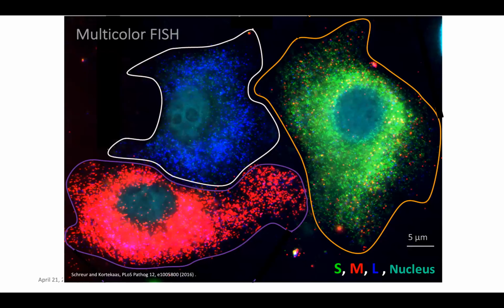We know that in biology, not a single species can work on its own. For most cases, individual genes need to cooperate to make one cellular activity. In that sense, we always want to see as many genes as possible. We are never satisfied by the capacity of the imaging. This is the initial effort to enable multicolor, or what we call multiplex, RNA FISH, where we use different colors, or we can also use lifetime as this kind of metric to differentiate different types of RNAs.